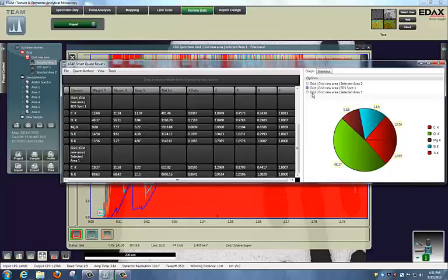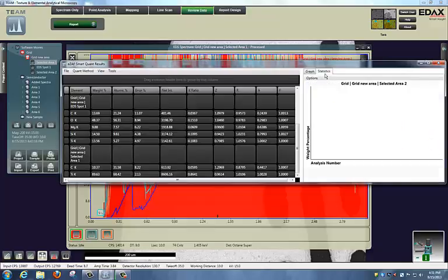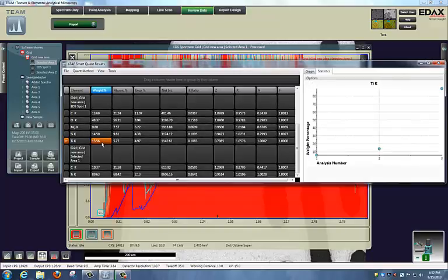You can show in graphical form those results, and even do some statistical analysis by clicking on the element of interest and then clicking on the statistics type. All of this can be saved as Excel or CSV file format.